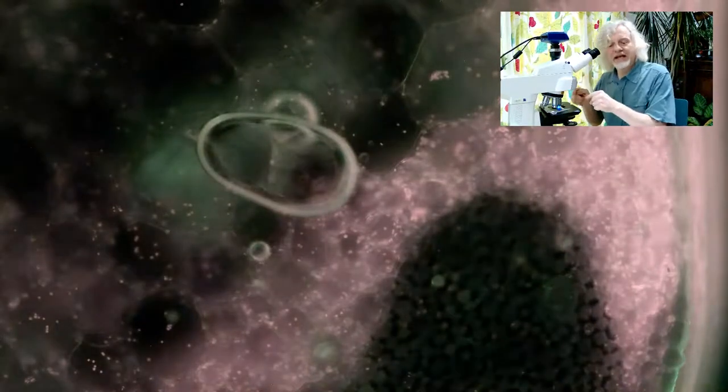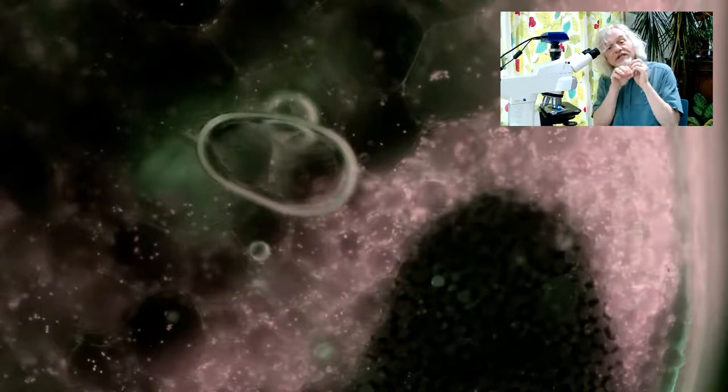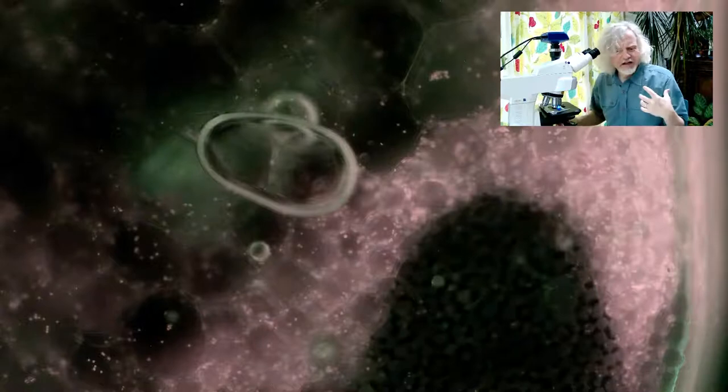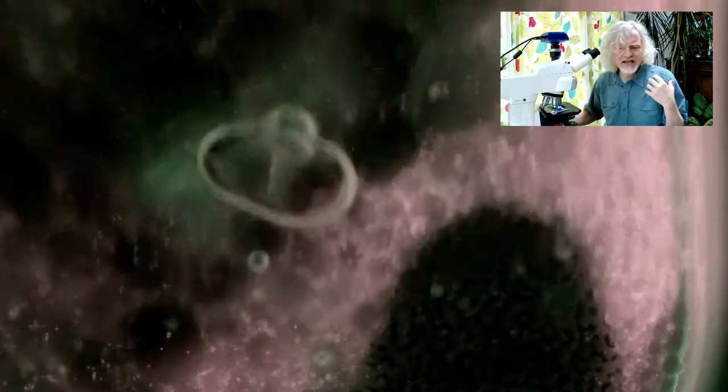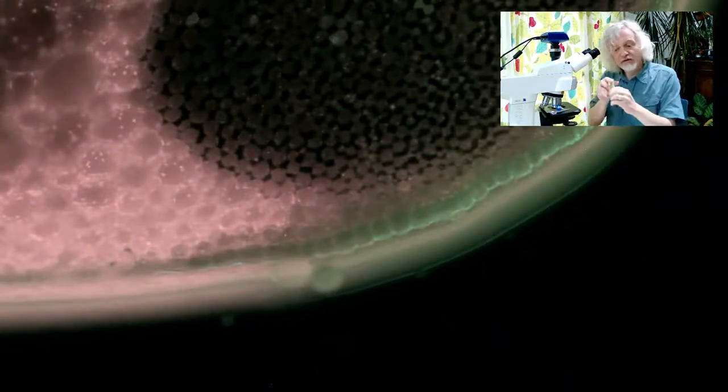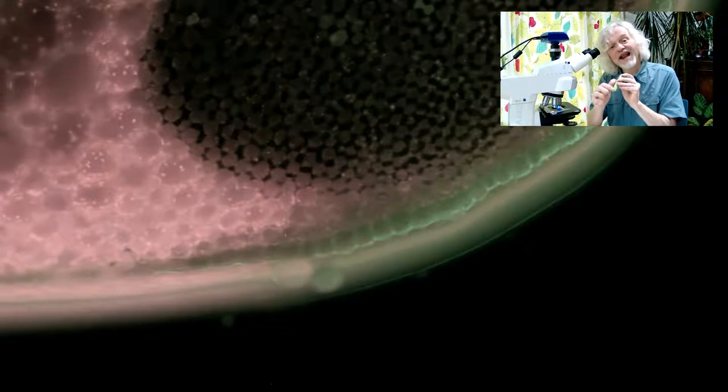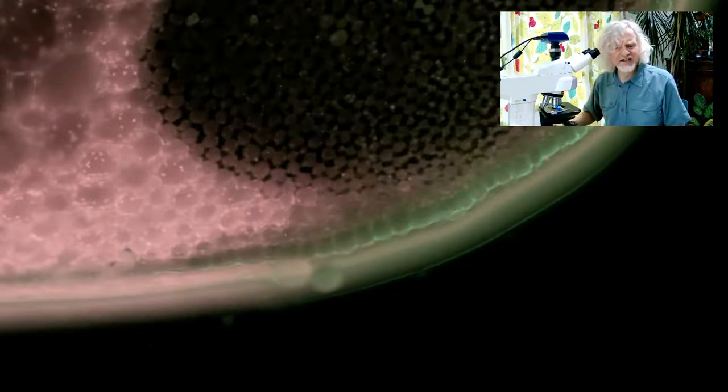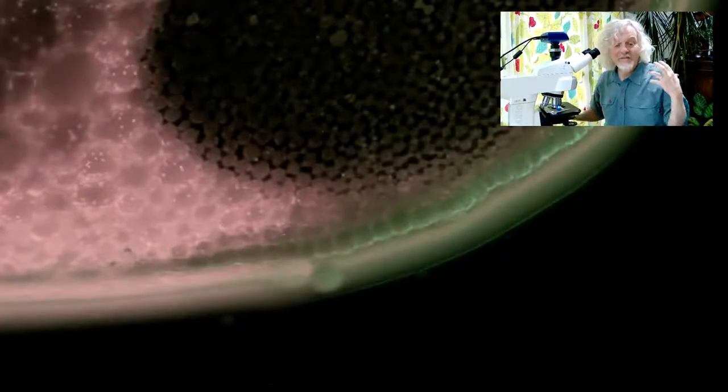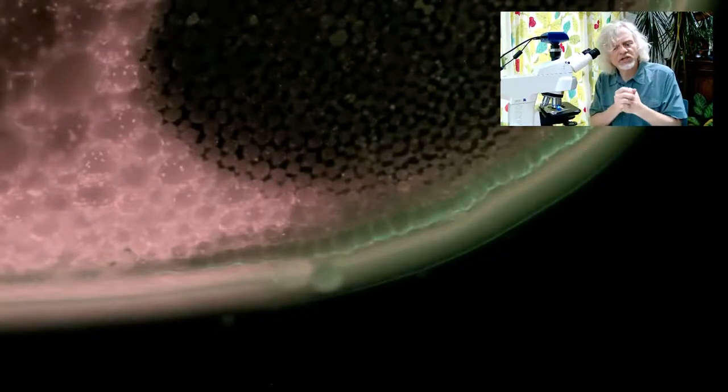So what you're seeing there is all the chlorophyll, which is the green stuff, glowing red, not green, which is slightly confusing. And in fact, you can see that the chlorophyll isn't evenly distributed. It surrounds the colenchyma. And in fact, that's because if you look here, this is the green outside edge. And it's actually, if you look here, in tiny, tiny little dots. And those are individual chloroplasts, which is where the photosynthetic machinery is.